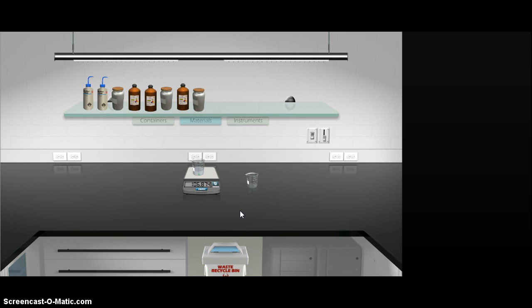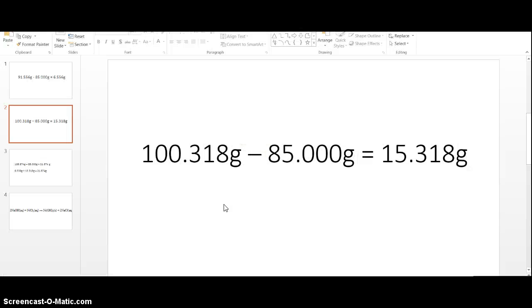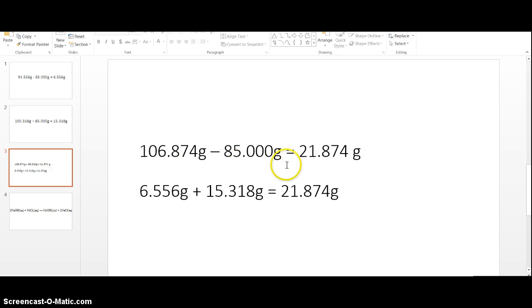If we place this on a balance, it turns out to be 106.874 grams. And after subtracting out the mass of the beaker, we can see that the conservation of mass is maintained, and the total mass of the product is 21.874 grams, as it was in the beginning.